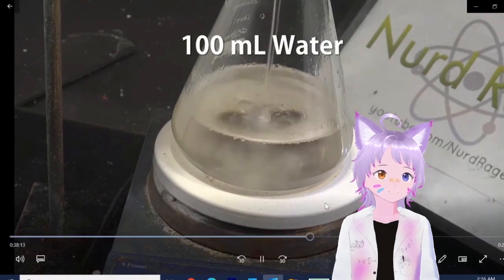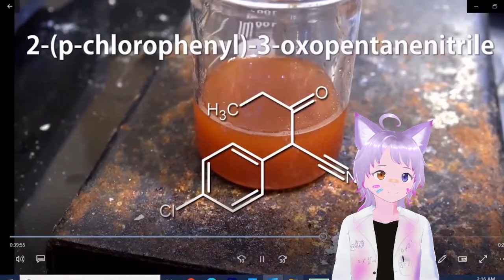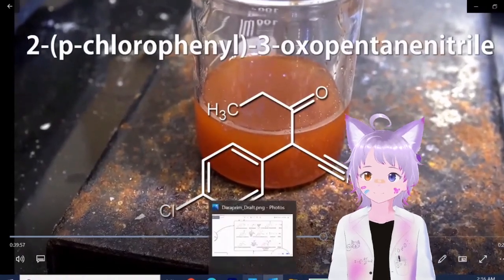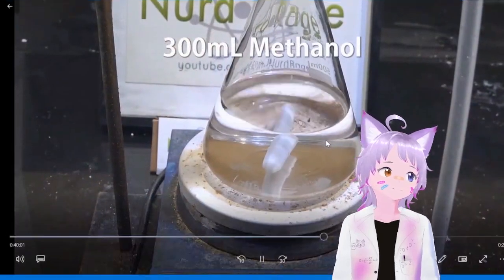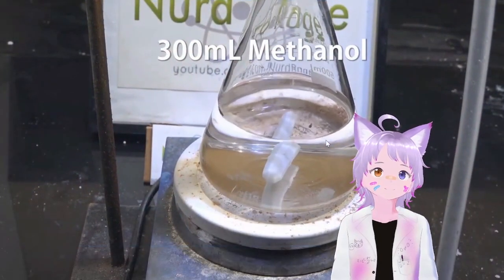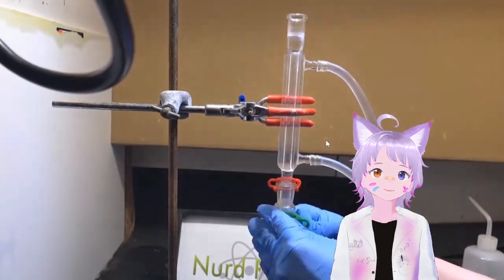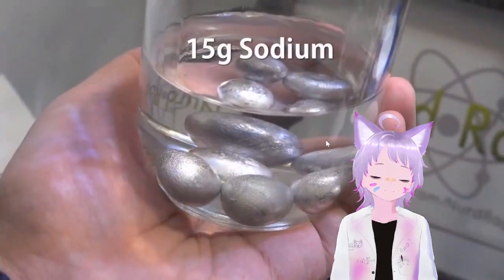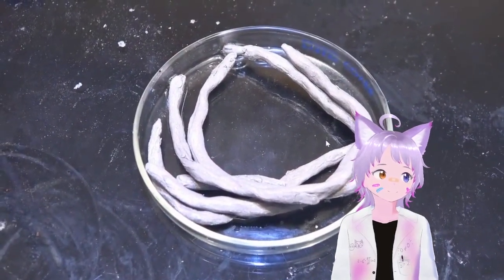To the Soxhlet extractor. We're going to make 2-p-chlorophenyl-3-oxopentanenitrile. First, we start with 300 milliliters of methanol dried and distilled from molecular sieves 3A, as I've shown in a previous video. Set up on top a reflux condenser. Now get 15 grams of sodium metal. I embed all the sodium into wires like this so we can drop it into the condenser.